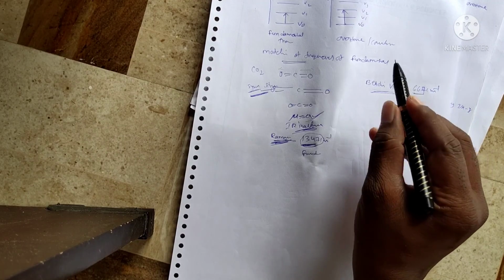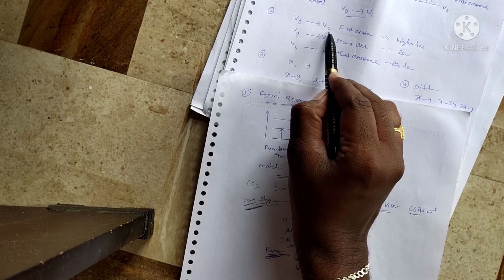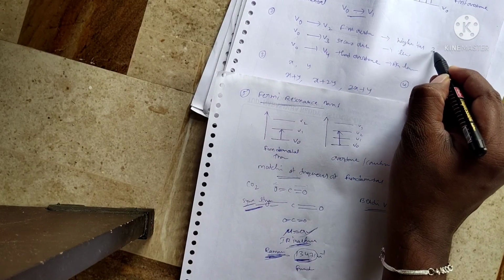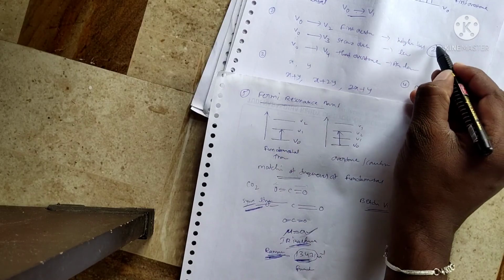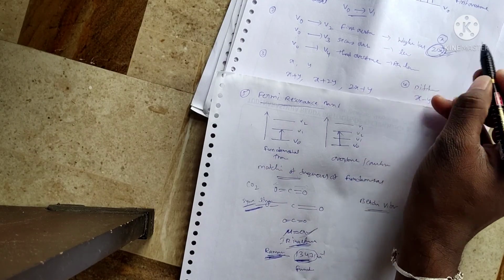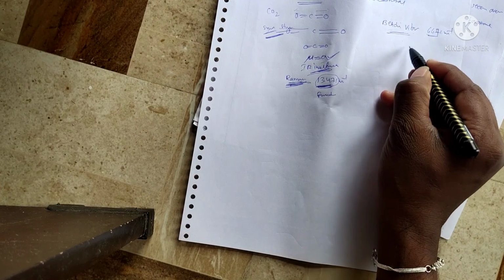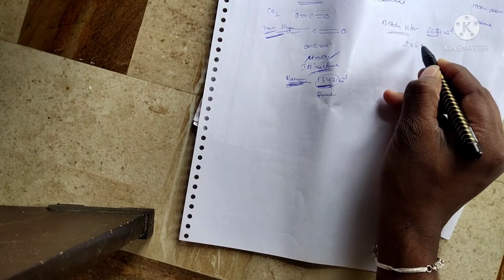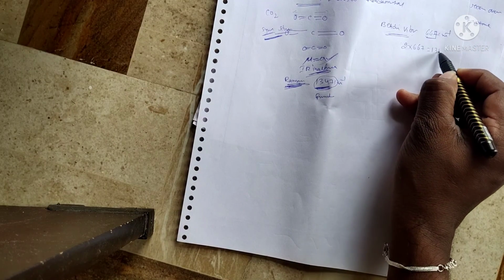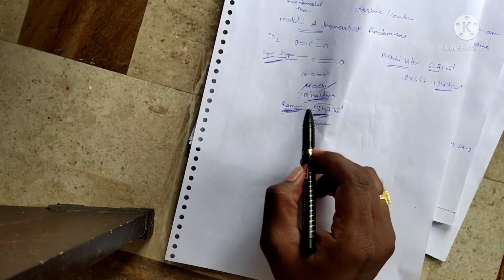And what is the overtone? Already we know that. V0 to V2 is nothing but the first overtone. First overtone means 2 times x, where x is the fundamental vibration value, so 2x is the first overtone vibration value. For example, we multiply this 667 by 2. That gives approximately 1347 centimeter inverse. Is it matching or not?